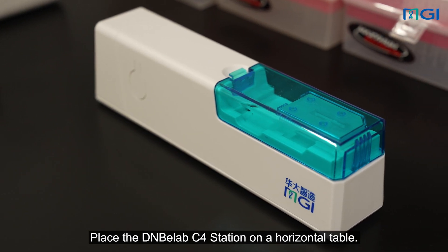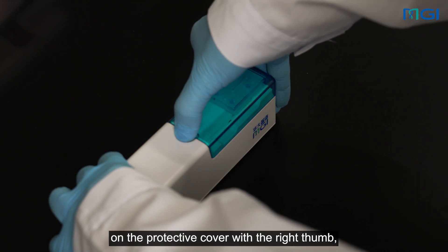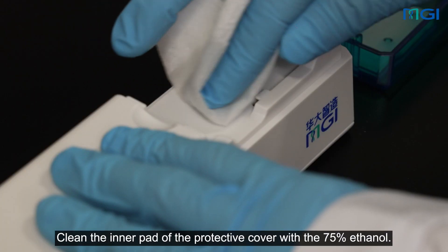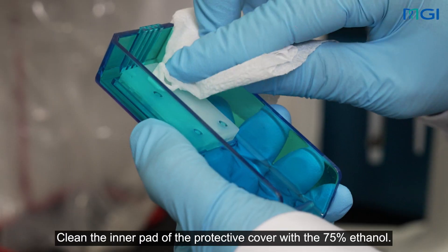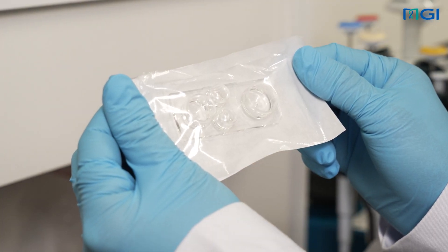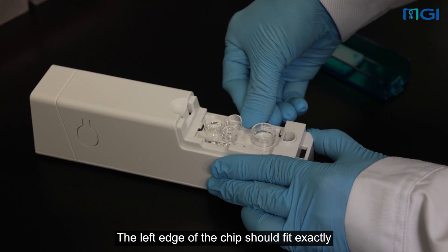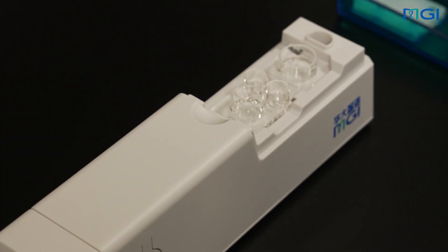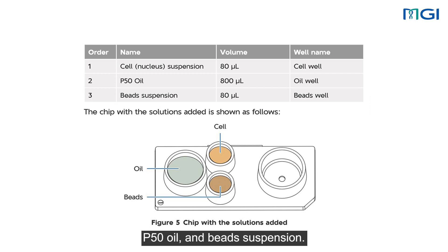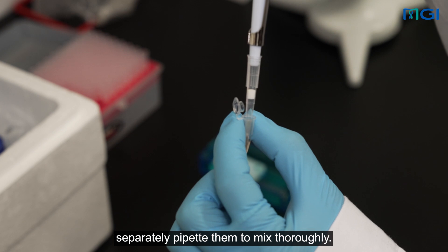Place the DNBLAB C4 station on a horizontal table. Gently and evenly press the buckle on the protective cover with the right thumb, and hold the other end with the other fingers. Gently lift up the protective cover to open it. Clean the inner pad of the protective cover with 75% ethanol. Take out a C4 single-cell RNA chip. Install the chip by pushing it into the chip slot from the side. The left edge of the chip should fit exactly with the left edge of the chip slot without any gap. Add the solutions to the wells in the order of cell suspension, P50 oil, and bead suspension. Before adding the cell or nucleus suspension and the bead suspension, separately pipette them to mix thoroughly.